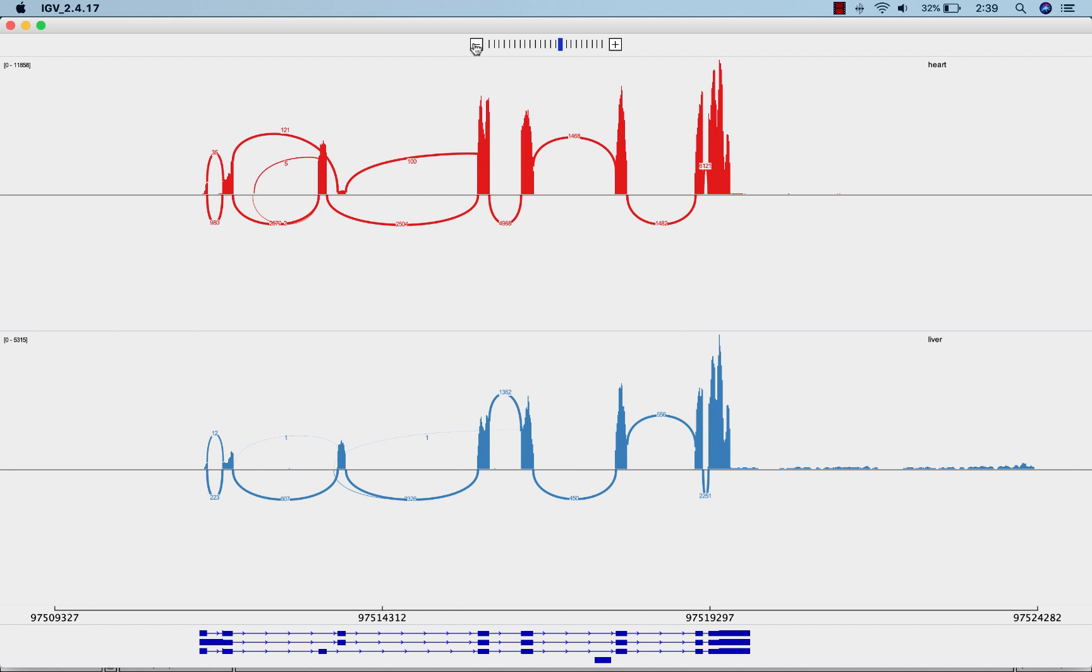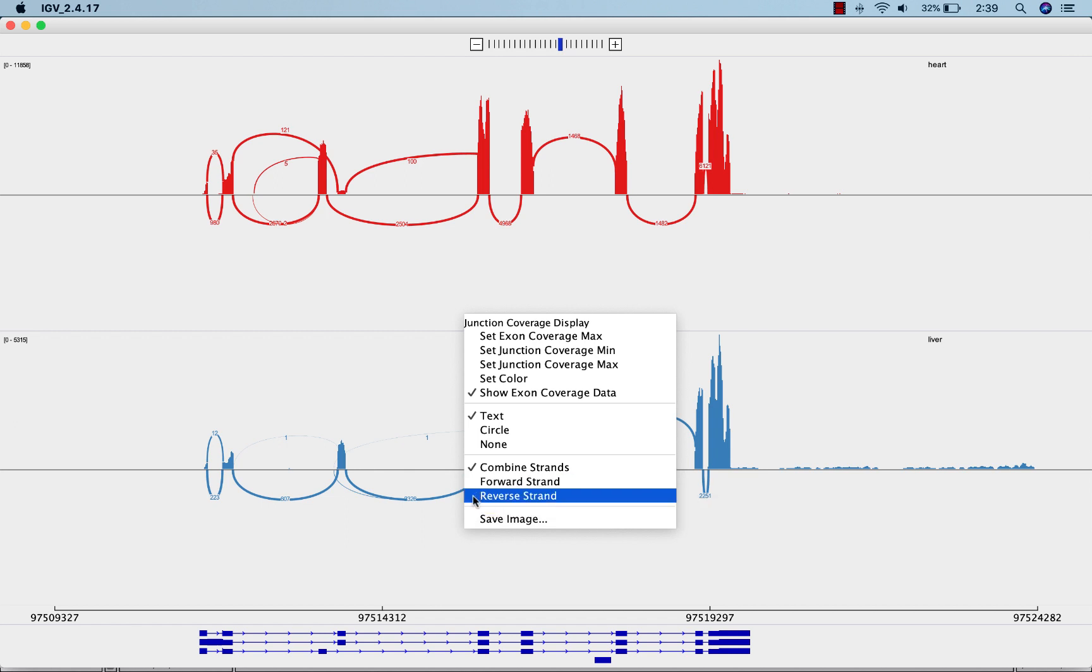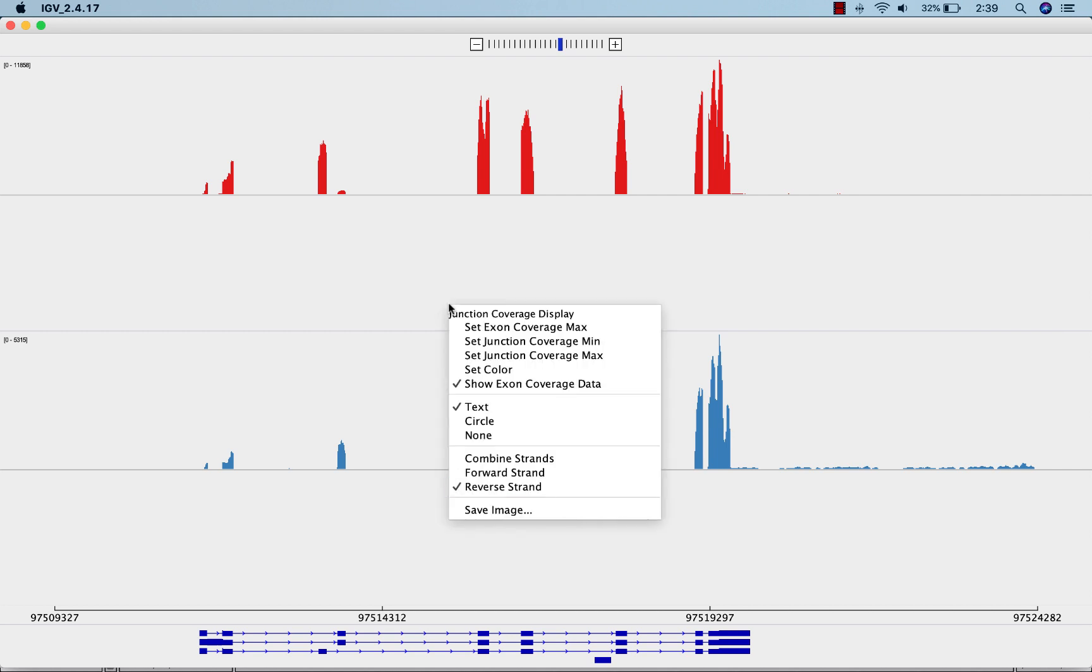By default, sashimi plots show arcs for splice junctions on the forward and reverse strands. However, you can change this by right-clicking and selecting the strand you'd like to see. Now, for example, only the reverse strand spanning splice junctions are shown. Looks like there are none for this gene. Let's combine the strands for now.